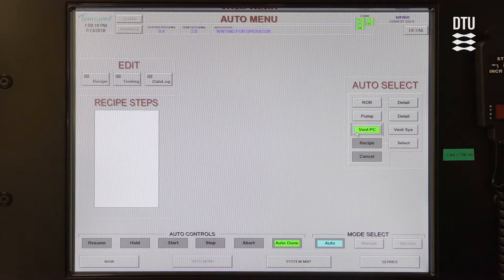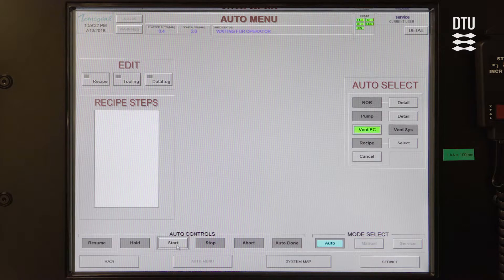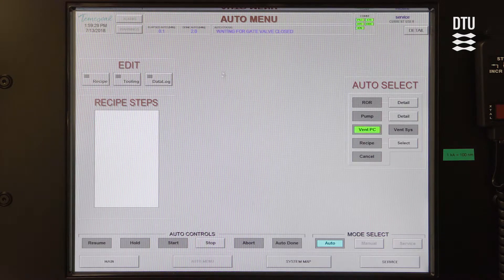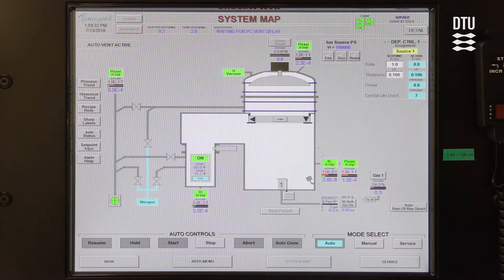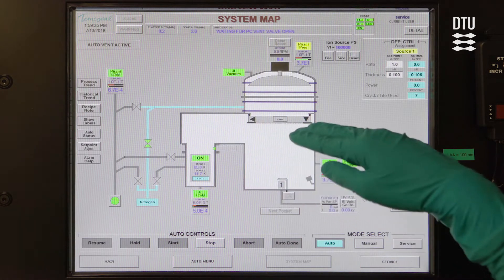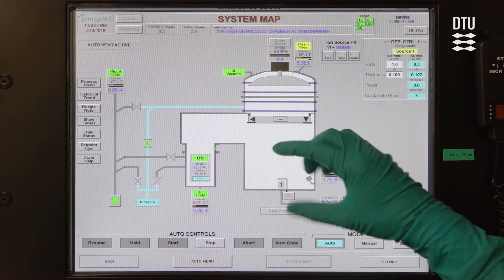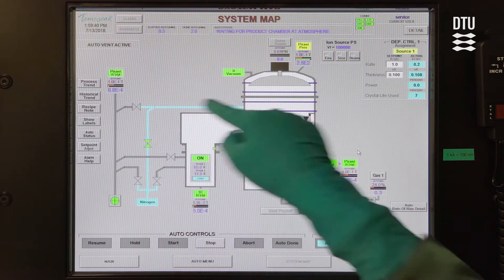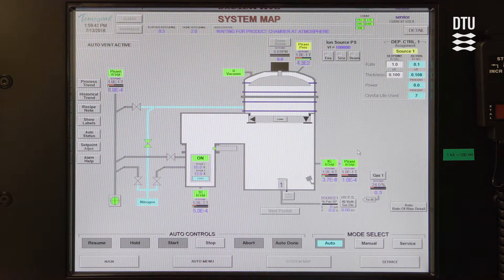We're going to vent PC and press Start. We can see in the auto status what's going on, and on the system map we can see that the gate valve is closing between the main chamber and the load lock area, and nitrogen is flowing in the top part of the chamber.